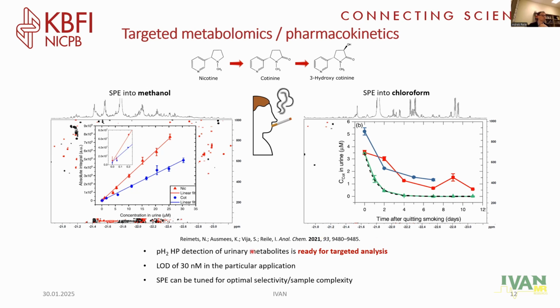So with this, we did, I think, a quantitative targeted analysis with NMR, something you cannot normally do with NMR. And in this study, we showed a 30 nanomolar limit of detection for this method.